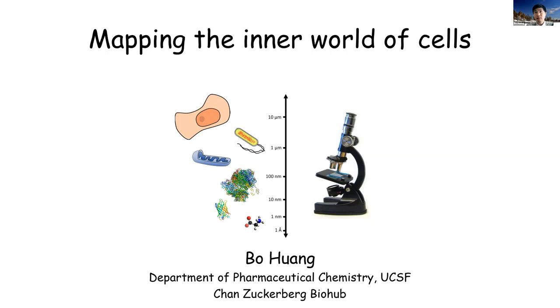So our goal in this case is to establish a robust enough protocol and test it, with guide RNA and donor DNA sequences, so that people who want to tag proteins endogenously can do it themselves with ease.